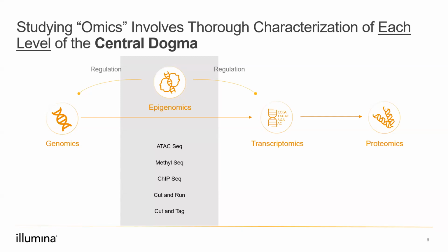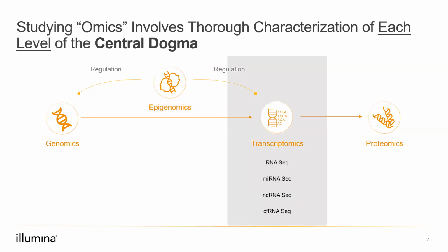And RNA sequencing remains the most common application of NGS because transcriptomics connects the genome to gene function, and measuring RNA most frequently provides a functional context to our understanding of samples. And importantly, detection of altered pathways may identify therapeutically exploitable mechanisms. RNA sequencing via NGS has also expanded to include analytes like non-coding RNAs, microRNAs, or circulating cell-free RNA transcripts.